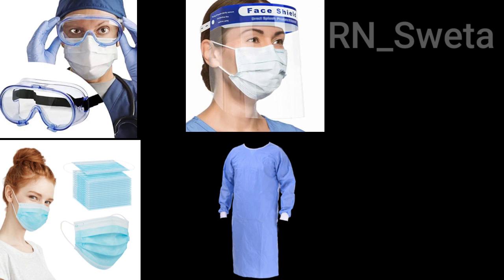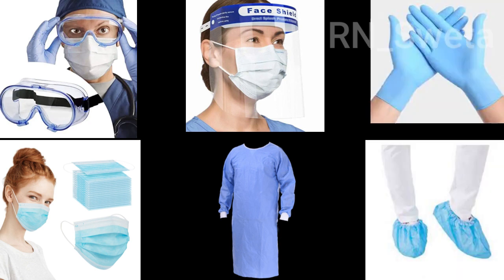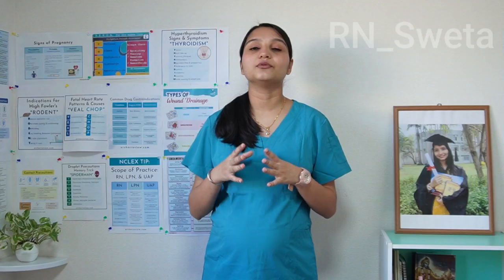So today we are going to learn about all the protective measures that we use, like goggles, mask, face shield, gown, gloves and footwear, everything that we use as a standard precaution to prevent the transmission of diseases between two individuals.